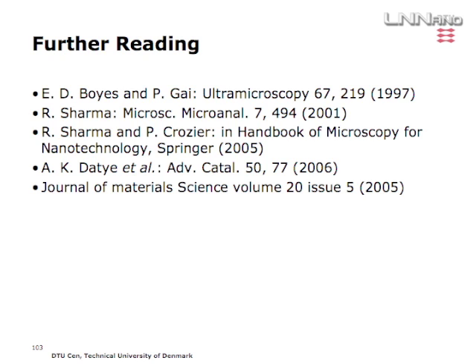Abhaya Datye wrote a very nice paper together with the Topsoe people, also a review paper on the state of the art of ETEM. And there's a whole volume of Journal of Materials Science devoted to in situ techniques, which shows a lot of this.